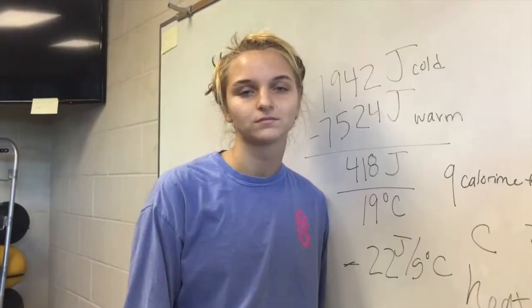Camille has stepped out for the time being, but we're going to continue with our labs. Part 2, determining the specific heat of the unknown metal.